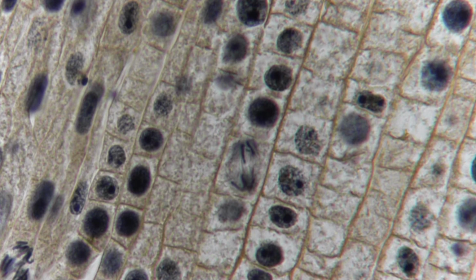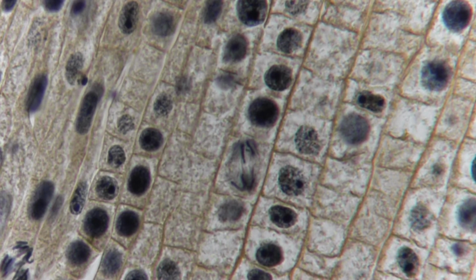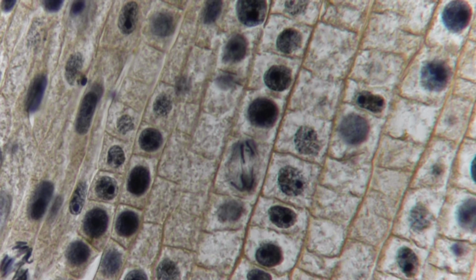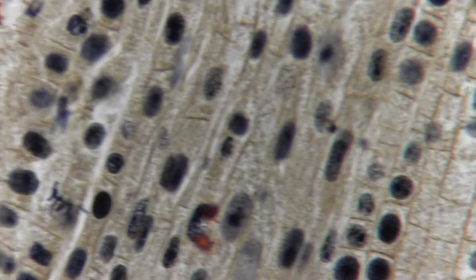The cell wall is the rectangular border. The chromosomes are those dark purple things that are kind of V-shaped. The spindle figures, you draw it very, very faintly between them, and the cytoplasm is just the pink grainy stuff outside. And then the chromosomes that you see pretty long there, they're going to tighten on telophase. So now I got to go back up and to the left for a telophase, so don't let it make you dizzy. So I'll go slowly here so it won't make you dizzy.